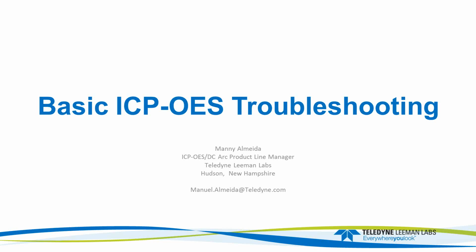Okay, thanks, Shelley. Hello, everybody. Thank you for taking the time to attend this webinar. The webinar is going to be on basic ICP OES troubleshooting. I want to give people an idea, especially people with new systems or who don't have a lot of experience with their ICP, just some basic information and how to go through some logical troubleshooting.